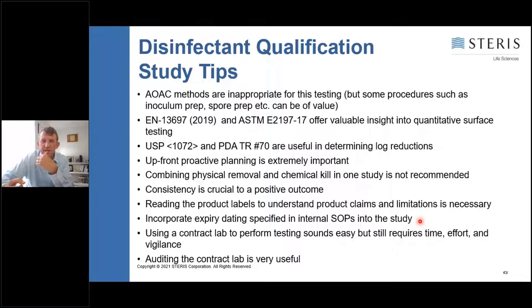Training is essential in these methods. So it is valuable to use an experienced lab, but even if you're using an experienced contract lab, you still need to make sure that you know exactly what they're doing, that they've been adequately trained, that you're monitoring the protocols and monitoring the data, asking the right questions, looking for anything anomalous in your results, and even auditing the contract lab physically or virtually to make sure that you're comfortable that they can get you the exact right type of results that you need.